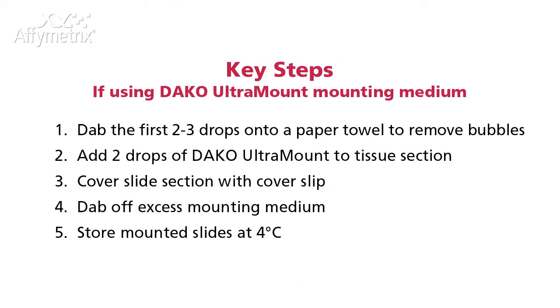Dab the first two to three drops onto a paper towel to remove bubbles. Add two drops of DACA Ultra Mount to tissue section. Cover slide section with cover slip. Dab off any excess mounting medium on a paper towel and store the mounted slides at 4 degrees Celsius.